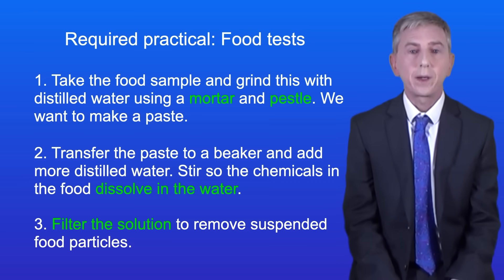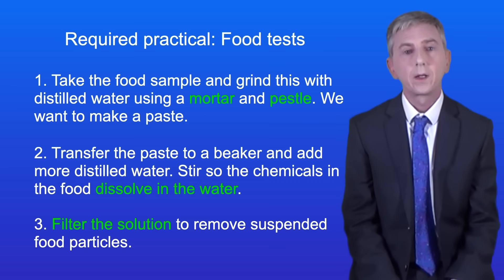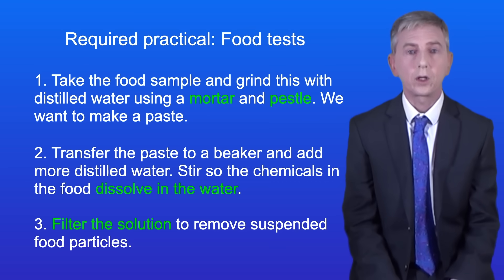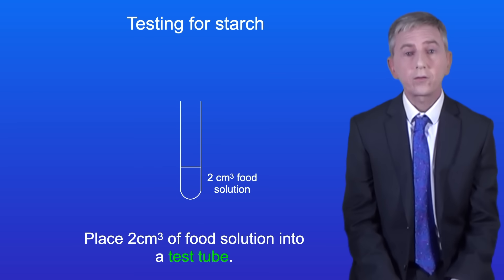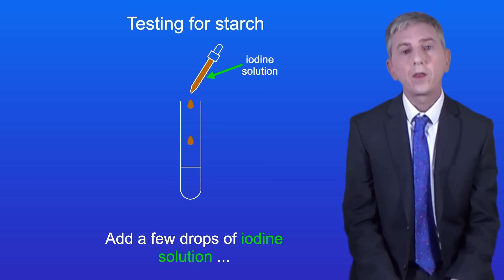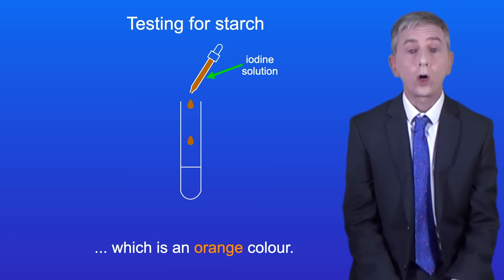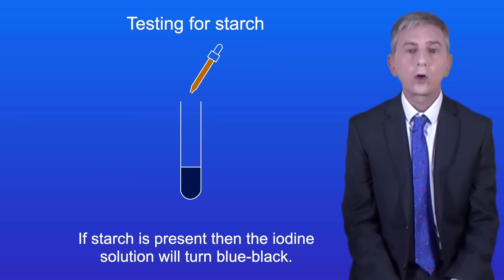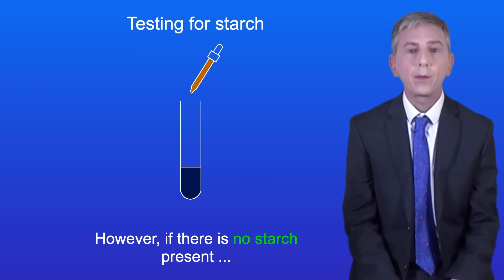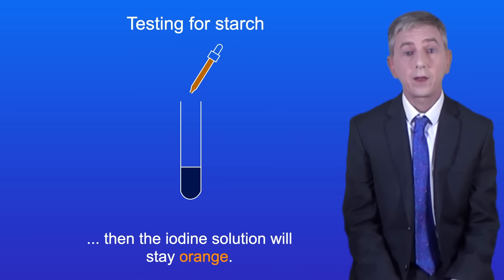We're going to start by testing for carbohydrates. Carbohydrates include starch and also sugars such as glucose. To test for starch, we place 2cm³ of our food solution into a test tube. We then add a few drops of iodine solution, which is an orange colour. If starch is present, then the iodine solution will turn blue-black. However, if there's no starch present, then the iodine solution will stay orange.